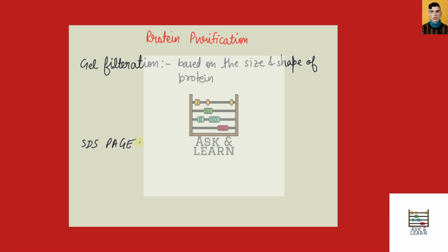Whereas SDS PAGE separates proteins on the basis of their molecular weight. So this is the basic difference between the principle of gel filtration and SDS PAGE technology.